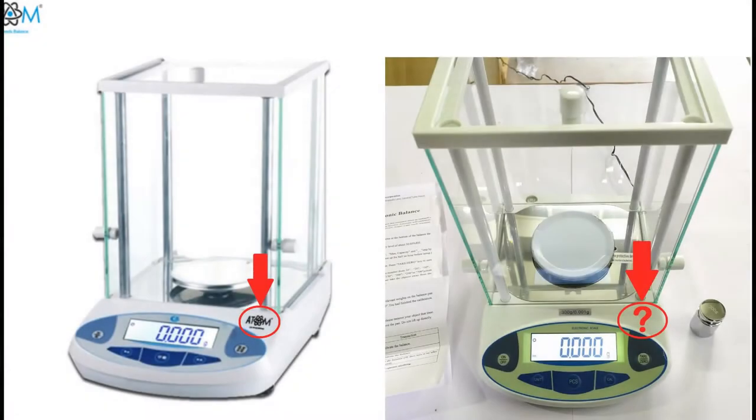The first thing that clearly caught my attention was the missing brand logo which according to the product images is supposed to be found right next to the LCD screen here. And neither is the model name A107 printed anywhere on this device. The complete absence of these identifying marks is clear indication that this is a generic weighing scale.